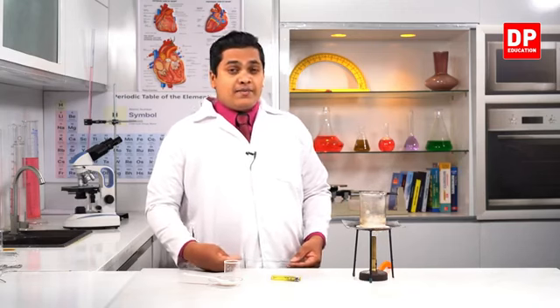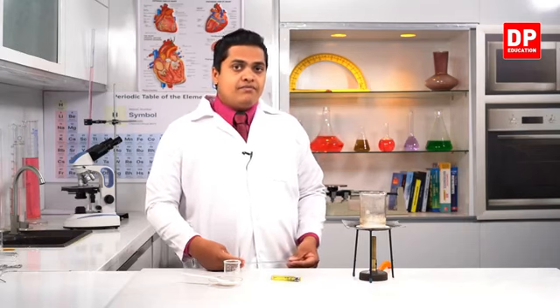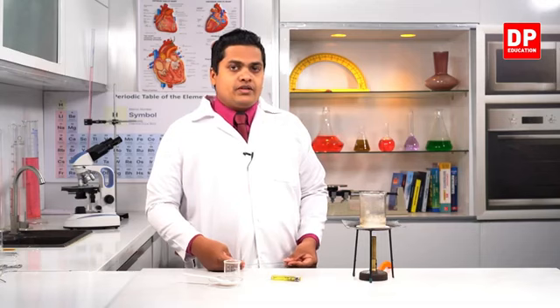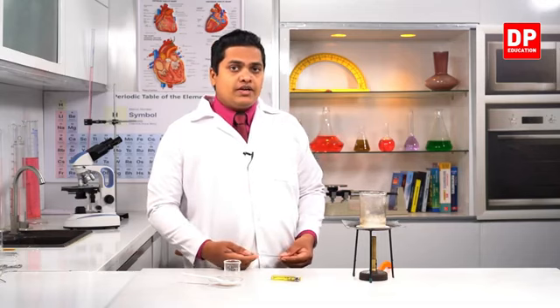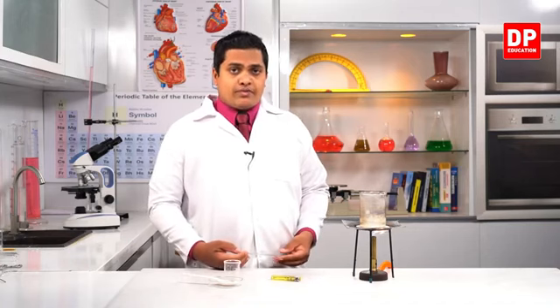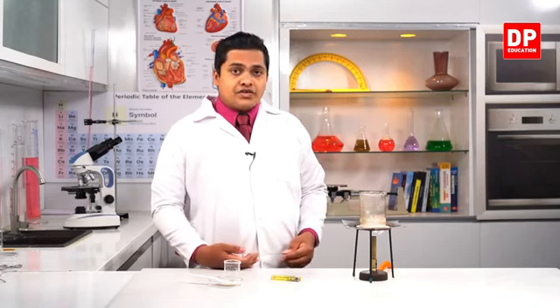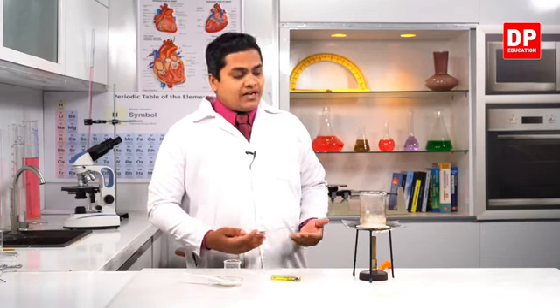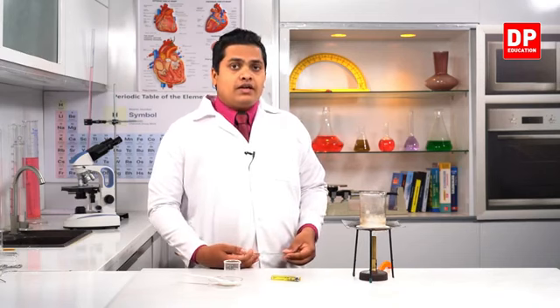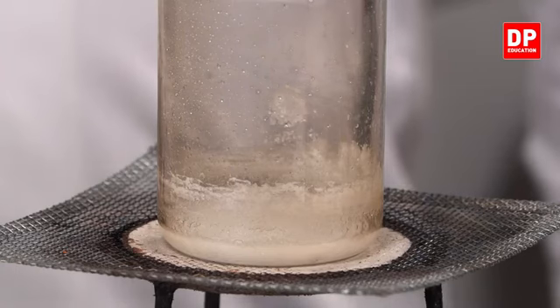Salt is chemically referred to as sodium chloride, which means that it contains sodium and chlorine. So the composition of sodium chloride is not getting changed when it dissolves inside water. When the water is vaporized, we can observe at the bottom the precipitation of salt. So here once again the salt has been precipitated, and we can observe at the end the salt crystals.